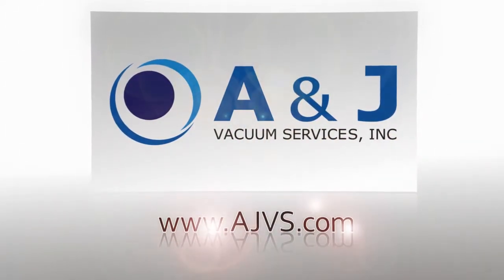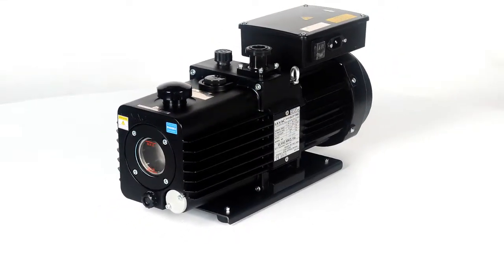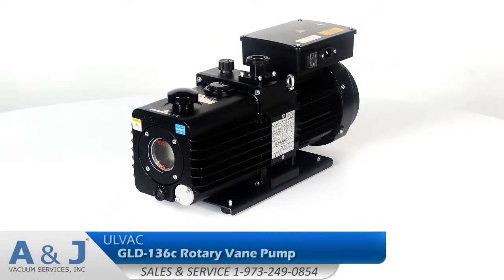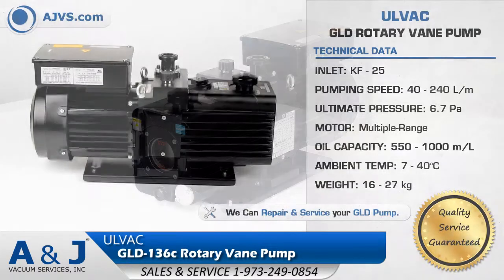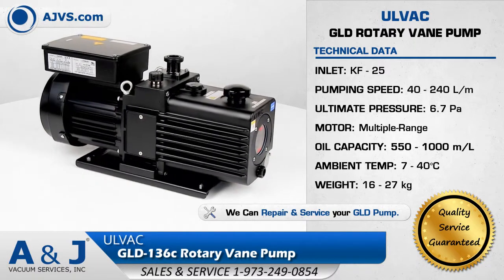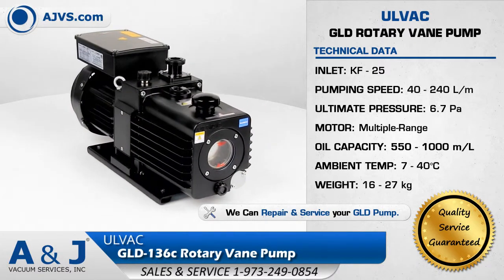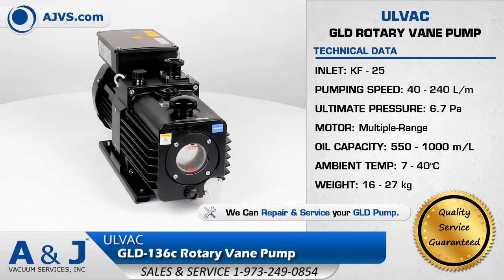AJVS.com, your worldwide leader of high vacuum equipment. The Olvac GLD Rotary Vane Pump Series features exceptional pumping capability, superior vacuum performance, and state-of-the-art design features.